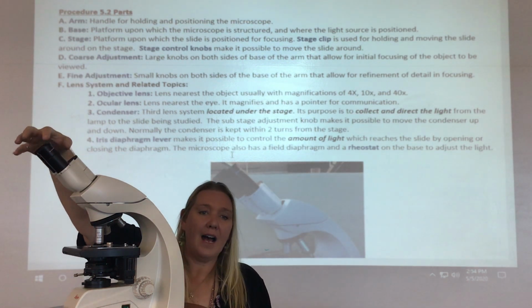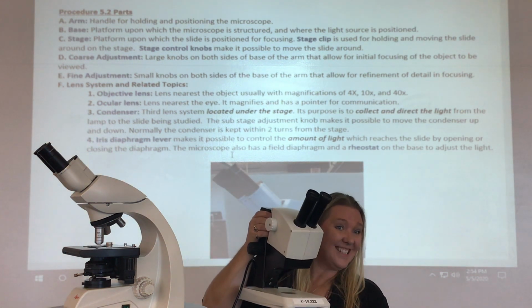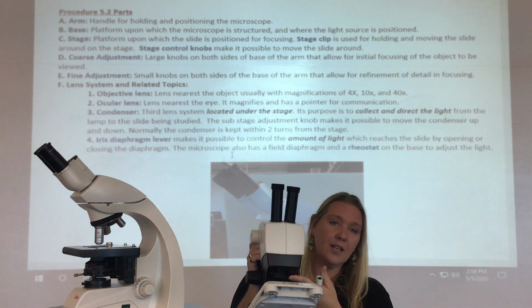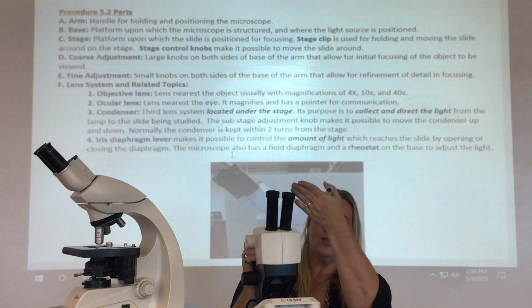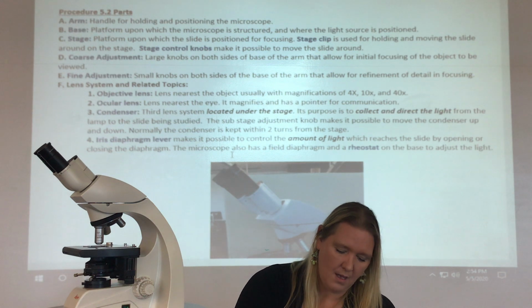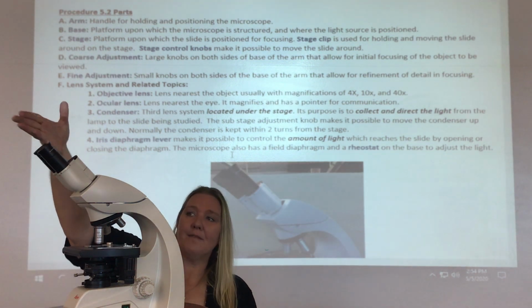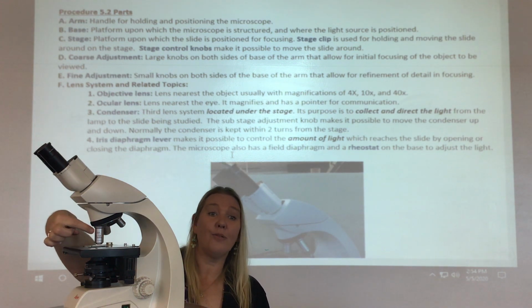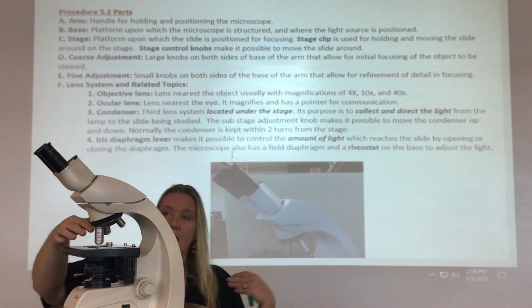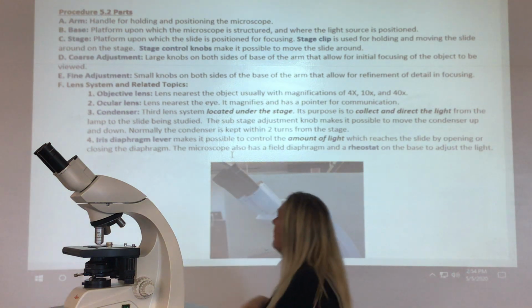These are gonna magnify 10 times. This whole microscope magnifies 10 times. This is the stereoscope, the dissecting scope. It's just these. If you look under here, there's no objectives. You just look straight down, it magnifies it 10 times, and you see the image. In the compound light microscope, you look in, it magnifies it 10 times, and then it's going to go through one of these objectives, and it's gonna magnify it some more. We have a chart later that will go through that. So 10 times, and then some more, and then we'll continue to talk.